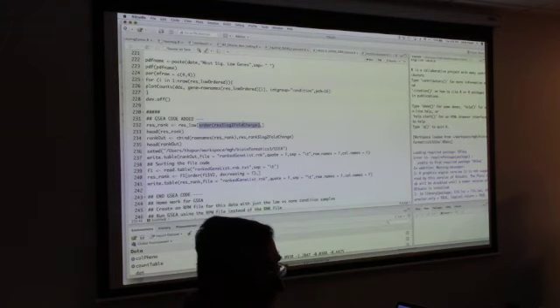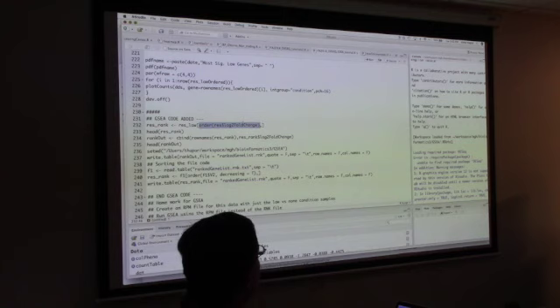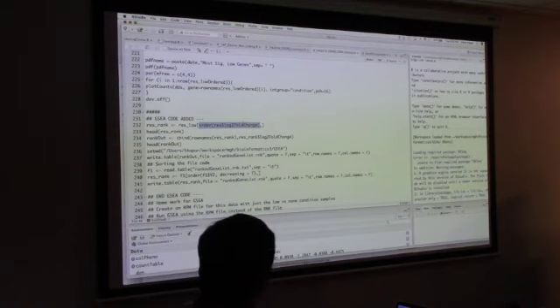Because we want to create a ranked list of our data set for the condition that we have just compared. So given that we're comparing high condition versus low, what is the result when ordered by fold change for that condition? Okay? So let's say we order that and then we call that res_rank.